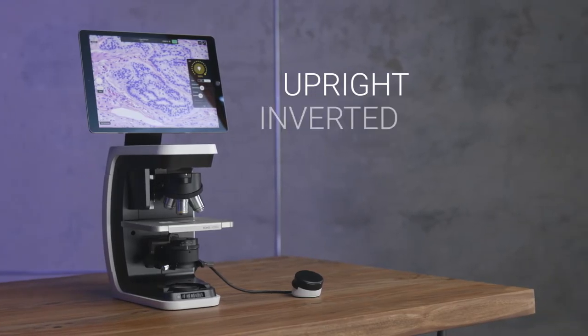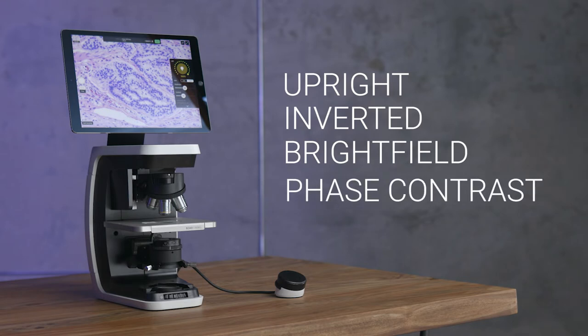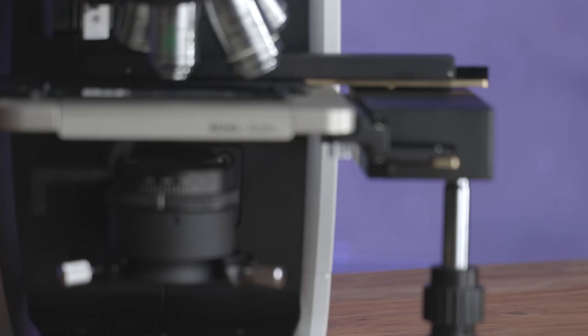With upright, inverted, brightfield, and phase contrast all in one system, REBEL is the most versatile microscope in its class.